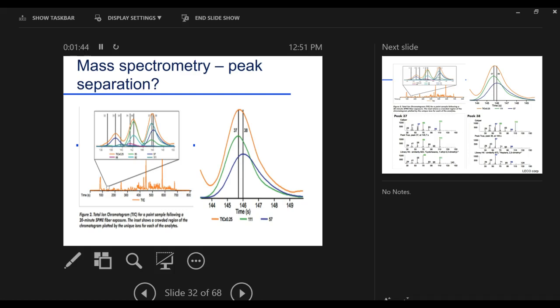This is a chromatogram, the output of the gas chromatograph. Each one of those peaks is at least one compound. And we took out this little bitty area that shows in between here, between 100 and 200. So it's just a little section. The detector, the mass spectral detector is coming alongside. Here's the peak, here's the peak, here's another compound with another peak.